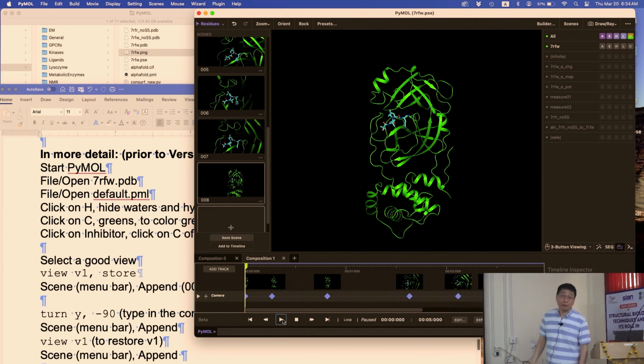So, oh, we have half an hour. What do we do now? Anyway, so now you made your movie. Very poor quality, but beginner's luck may be pretty good as well. But anyway, this gives you a flavor of what can be done. You can be really careful and make very fancy movies.